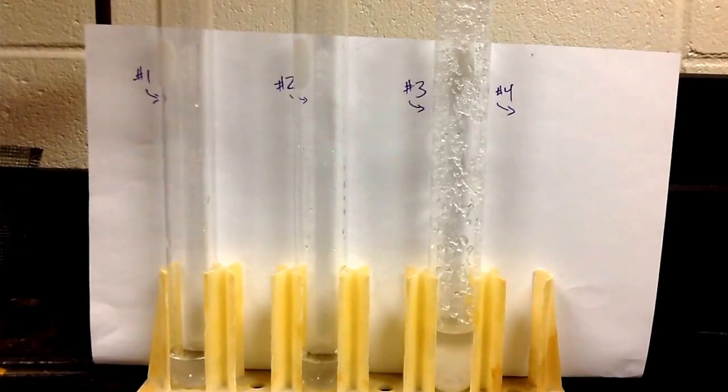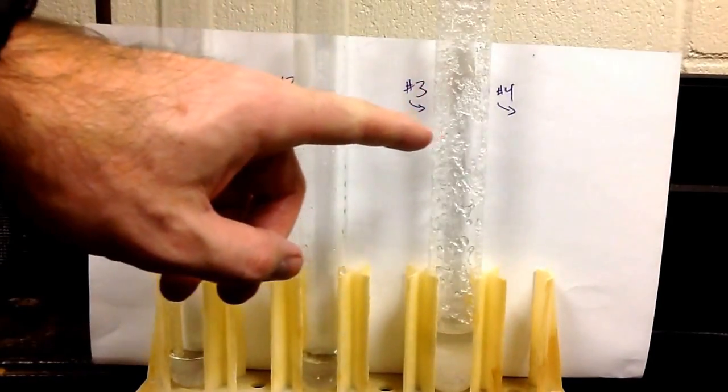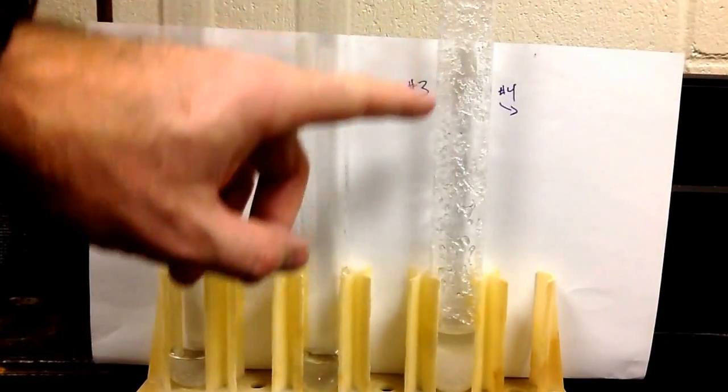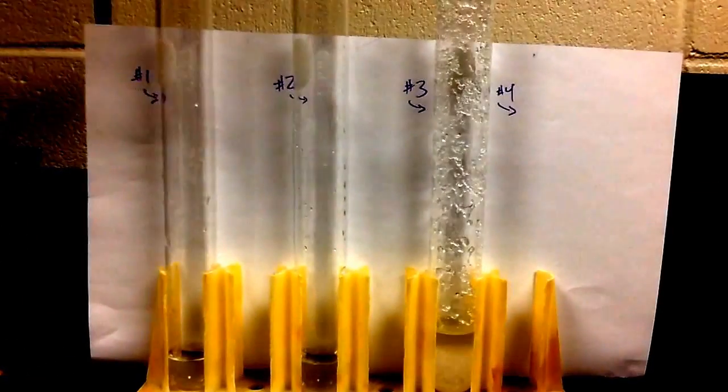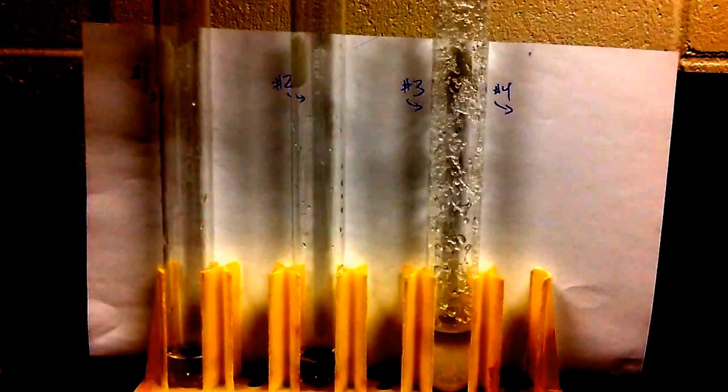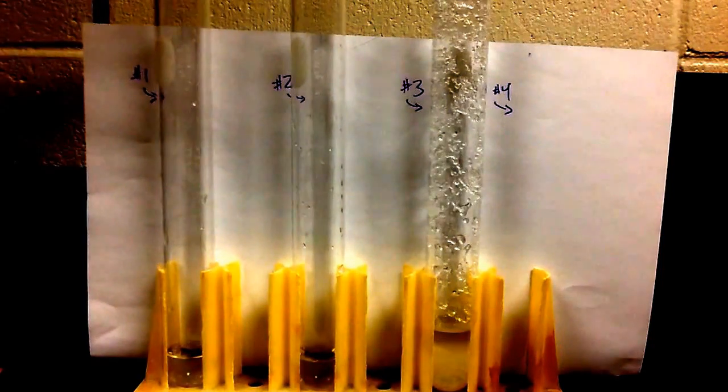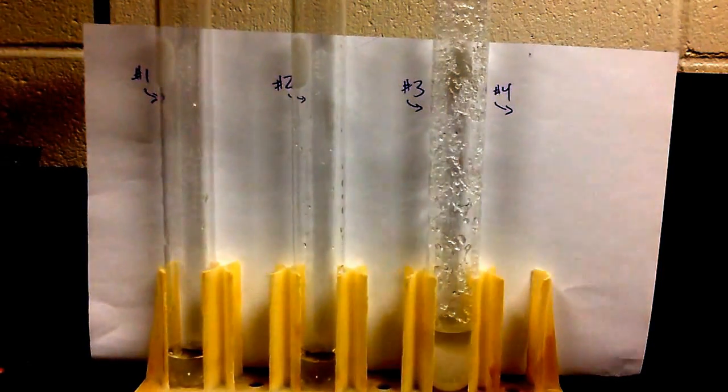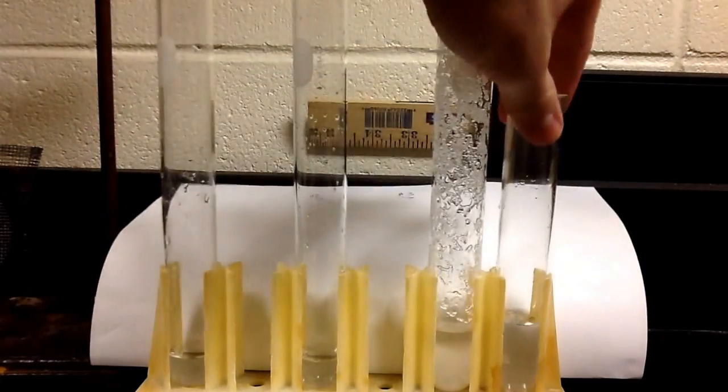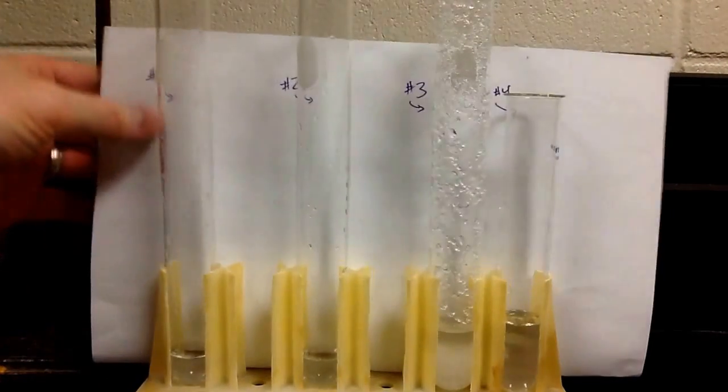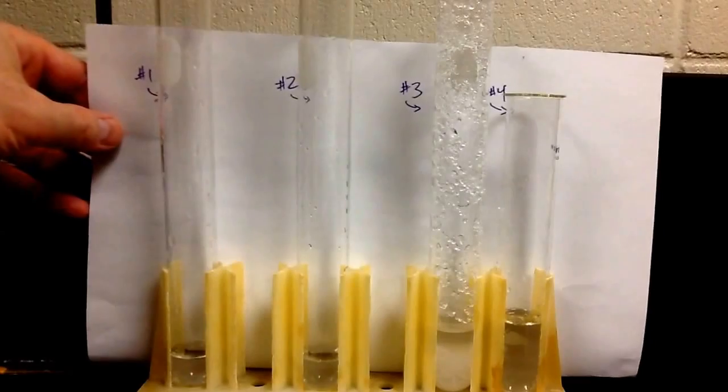We took basically what we have in test tube number three, we heated this up, we got all that solid that's in the neck of the test tube to dissolve, and then we put it in a cold water bath and let it cool down. So for time reasons, I've already done that for us, and I've got this particular test tube here.